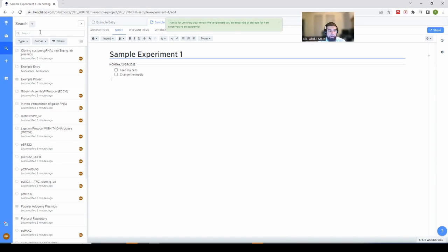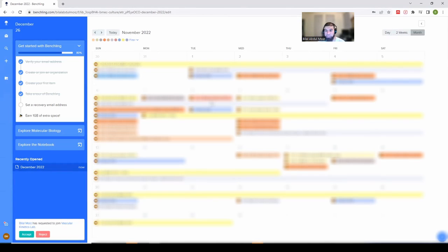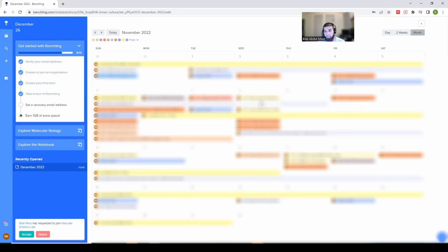Here's the calendar showing the experiments I ran back in November. Each project has a different color, making it easy to visually separate experiments. You'll also notice multi-day experiments — those are my cell differentiation protocols for tracking my stem cells, which need to be fed media on certain days. I set up a template to help keep track of that. It's really easy to figure out when I ran these experiments and cross-reference any notes with dates.